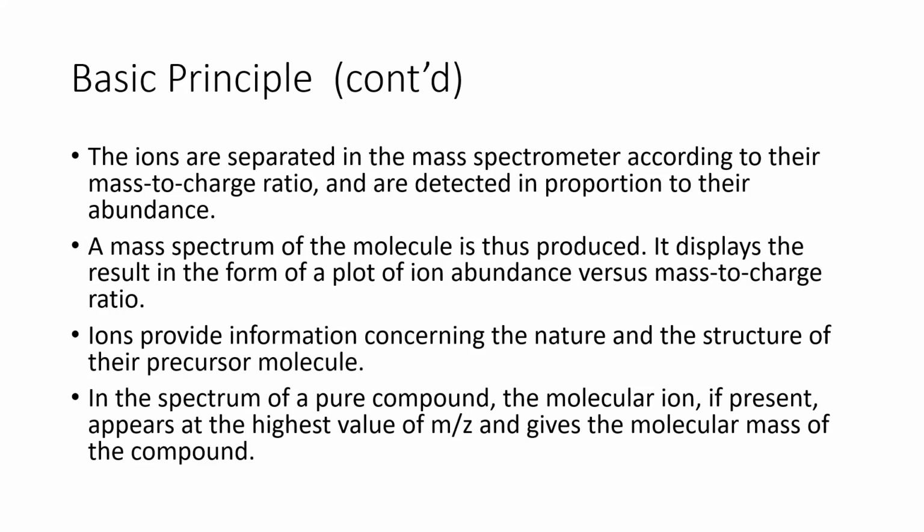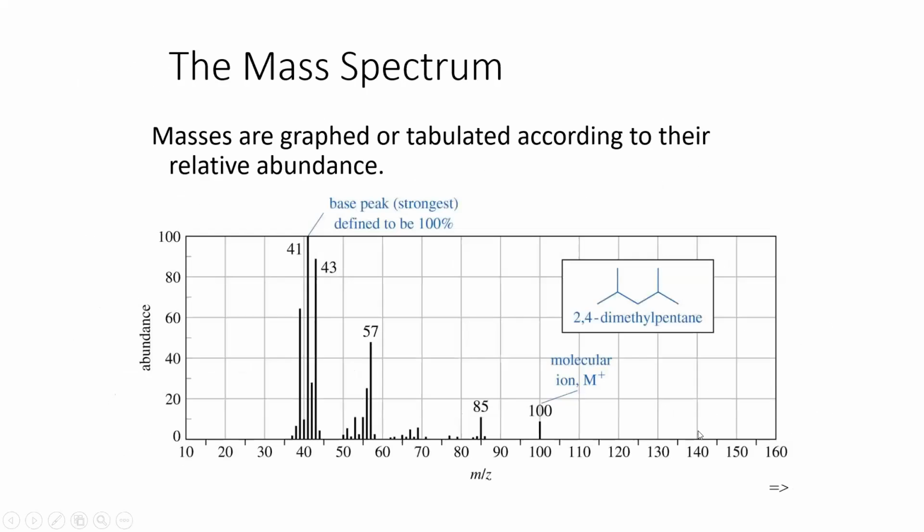Until you bring all the pieces together, you can never have a complete representation of the map of Nigeria. Exactly the same way, when you have the fragment ions, all the fragment ions must be brought together, and that will give us the information about the molecule that gave rise to those fragments.